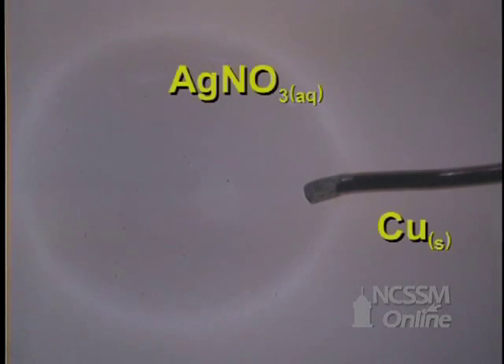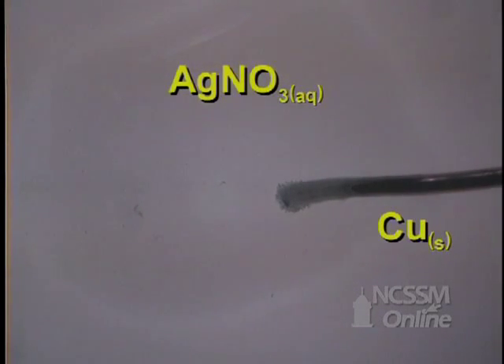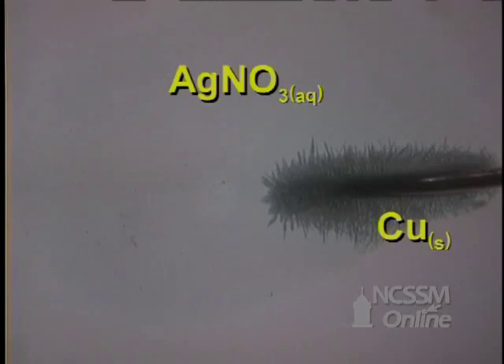To get a closer look at a single displacement reaction, which is also an oxidation-reduction reaction, we will use a microscope camera to see the reaction between copper metal and silver nitrate.